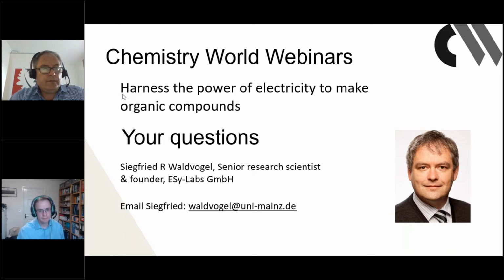Then you do not lose too much energy because of the polarity switching, and it helps the crystals pop off. Just keep in mind, sometimes you make an oxidative coupling and the hydrogen evolution is the counter reaction. And if you have to remove the crystals, then usually the evolution of hydrogen just lifts off the deposit or something like this. But it's not so bad. Often it's quite good. Yeah, okay, thanks, Siggy.